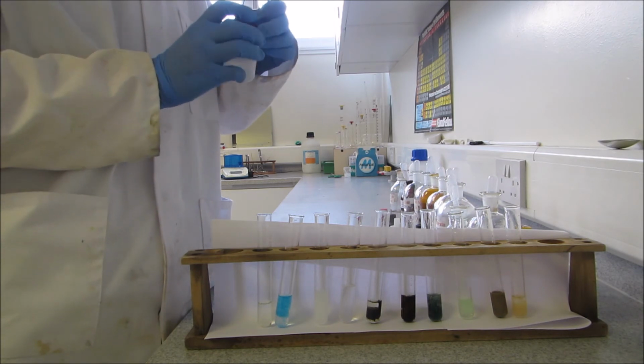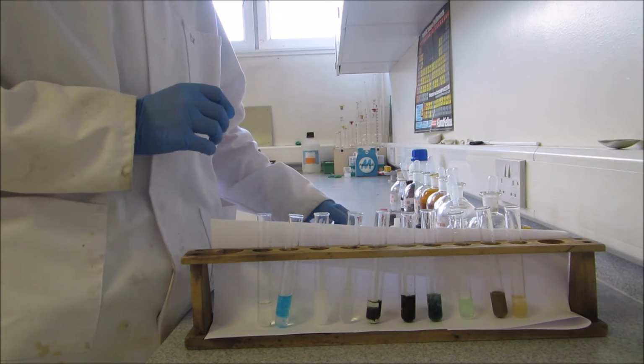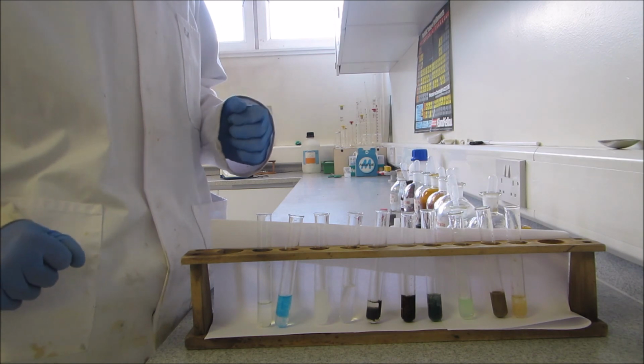So using sodium hydroxide you can identify a range of cations, but with a few of them you also have to back this up with a flame test to make sure that you know the cation.